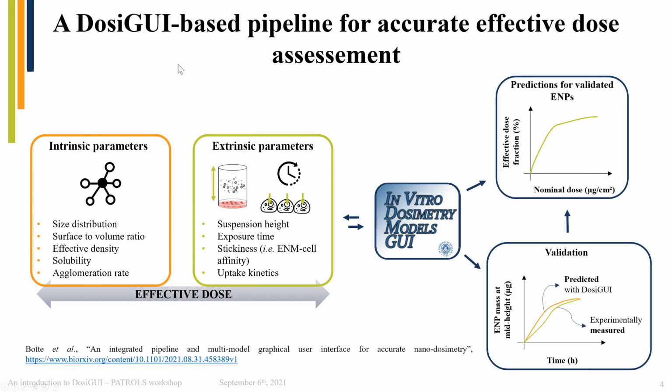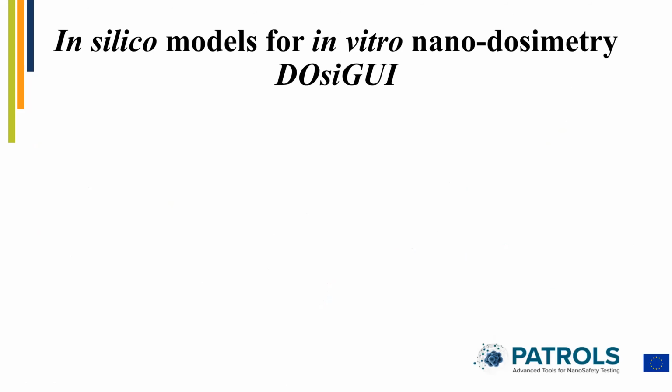And so I'm going to leave the floor to Pietro, who is going to first give you a brief overview about the interface of DosiGUI, so you can navigate the interface with Pietro and see the most important buttons you can use. And then we will have some examples of simulations to learn how to predict effective dose with DosiGUI. Thank you.